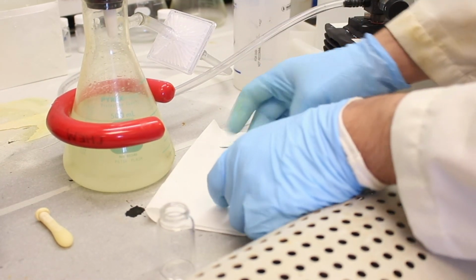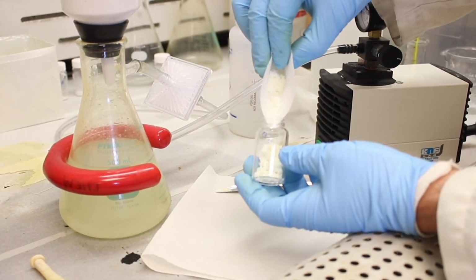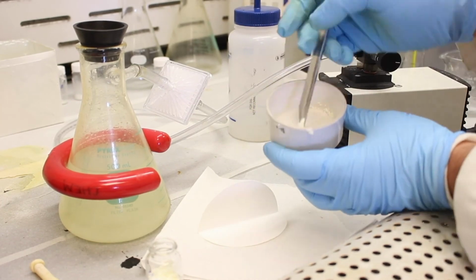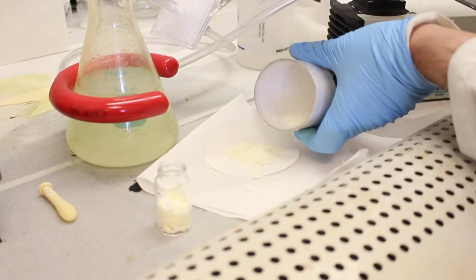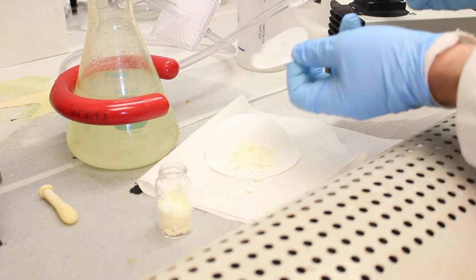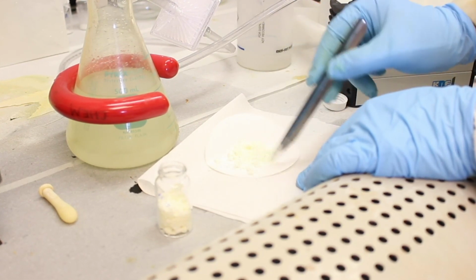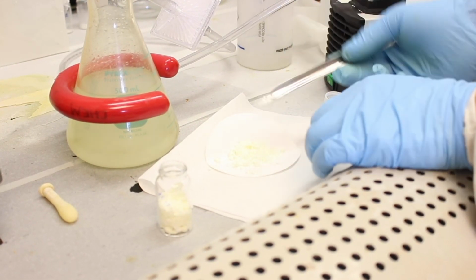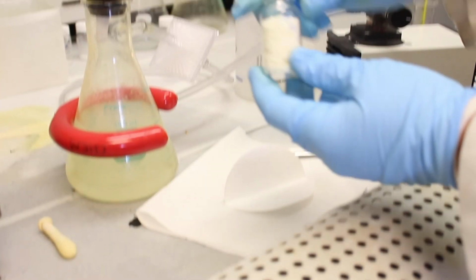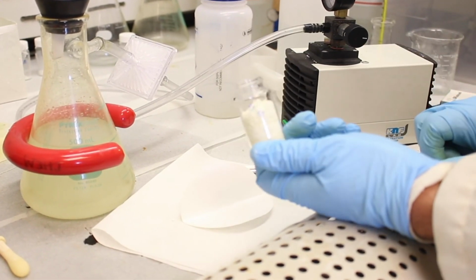We're going to transfer it to a scintillation vial here. Okay, we still got a little bit more. Okay, so I think that's sufficient. Just coax the little particles onto the paper. Okay, so quite a bit of product there. It almost fills up a scintillation vial to the top.